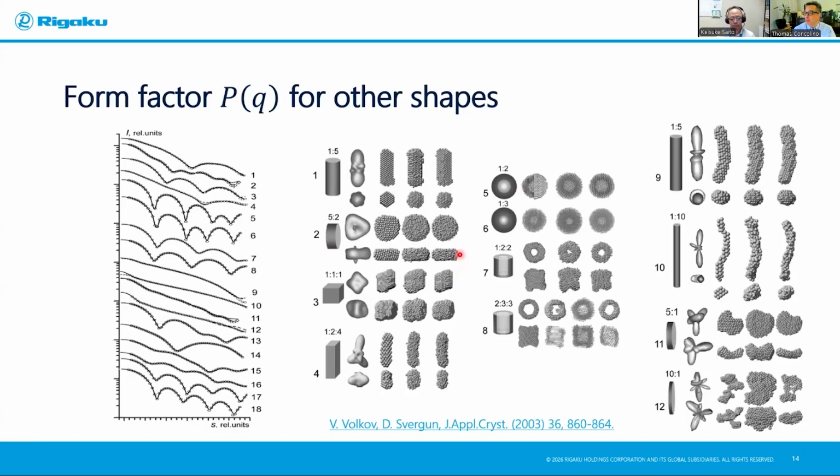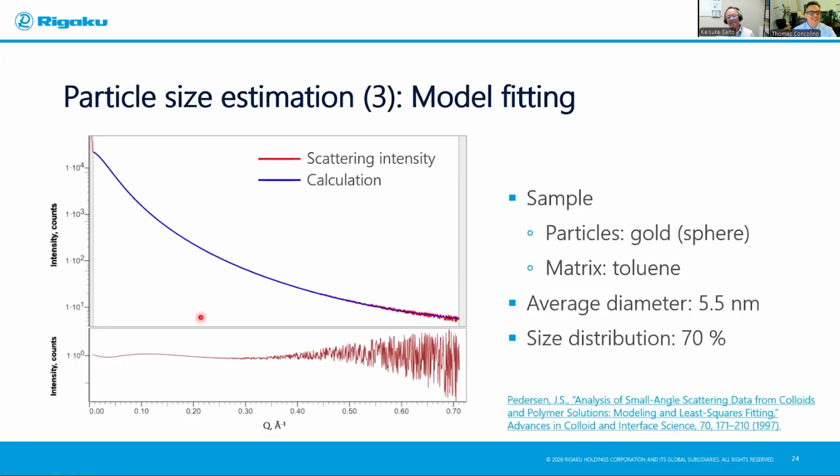Then the last question was, can SmartLab Studio II do the reduction and fitting of SAXS? I think that's where our MR SAXS module comes into play. Thank you for choosing Rigaku, first of all. Yes, data reduction is possible.